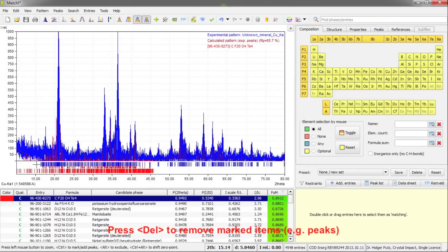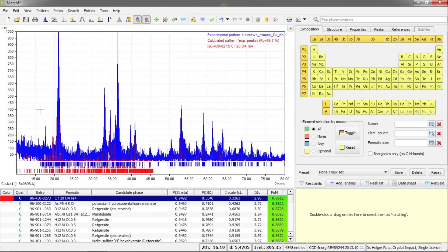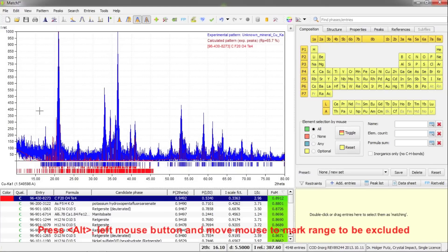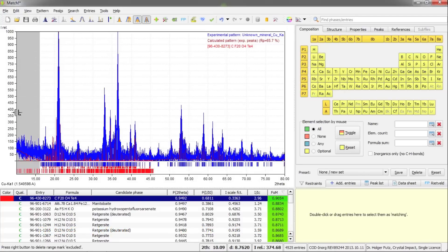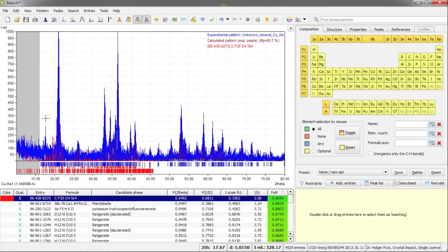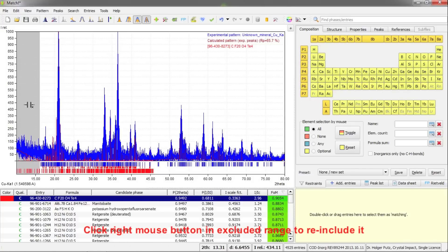Another option is to declare a region of the diffraction pattern as excluded from, for example, search-match calculations. To do so, press the Alt button on the keyboard — the mouse cursor changes — then press the left mouse button and move it to the left. You'll see a yellow area, and upon release a gray background appears, showing that this part is excluded from search-match calculations and Rietveld refinements. To remove the exclusion, move the mouse on top of the area and press the right mouse button.